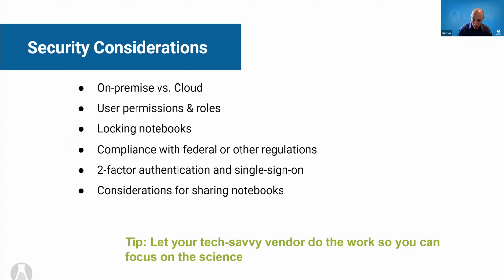If you don't, at least consider what's the relationship between an exported notebook that you're sharing with someone and the original one in the system, and do you have any way of demonstrating that you have the original and it's unchanged? Anyway, there are many more, but this is another nudge to involve your information and regulatory teams in this process.